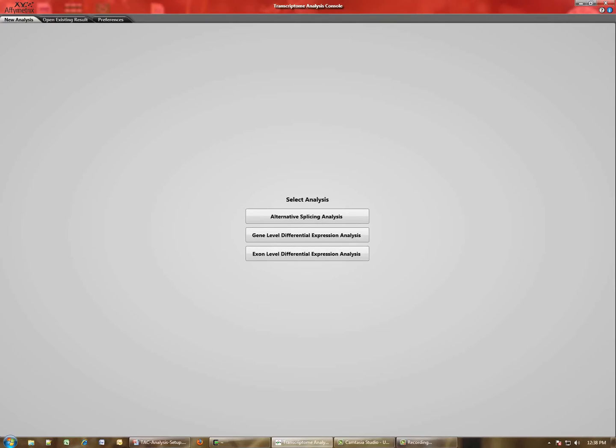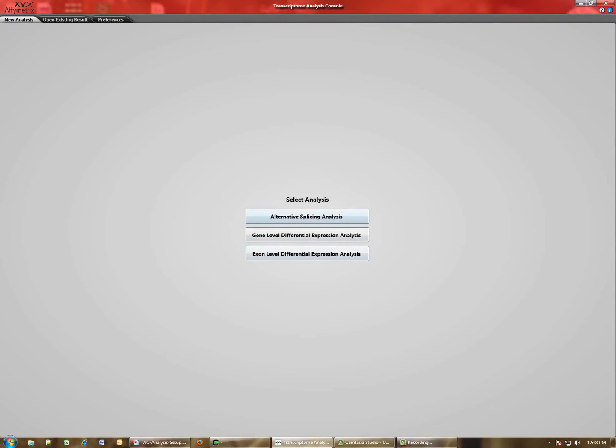One for launching a new analysis. If you have existing analysis results you want to open, you can do that from here. And the third tab is the Preferences tab. In order to perform an analysis, you would simply select the button for representing the level of analysis you wish to perform.